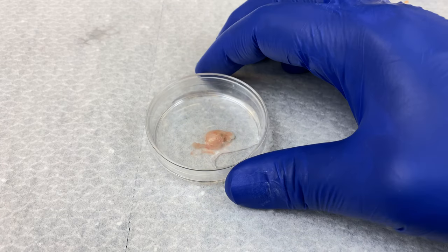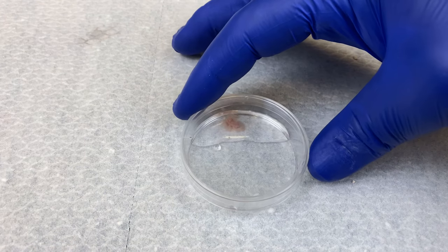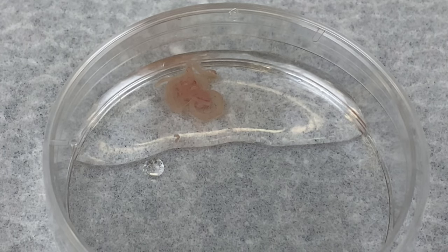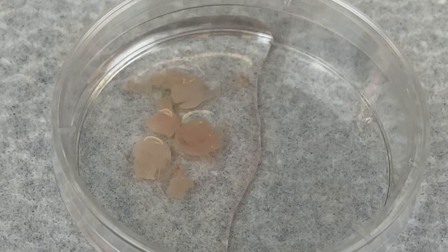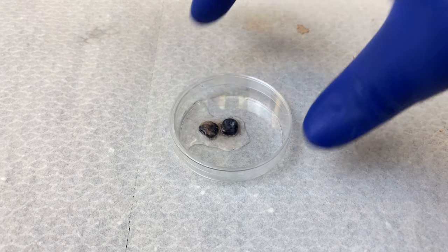Here we have the stomach with a bit of intestine hanging off the side. Here is the intestine itself — you can see it's very thin, looks kind of like spaghetti. Here we have pieces of the brain. The brain does not come out as a solid organ. And finally, we have the eyes.